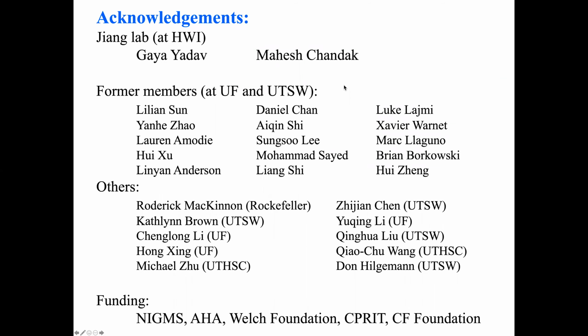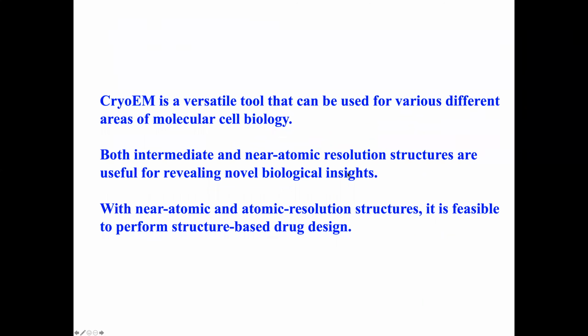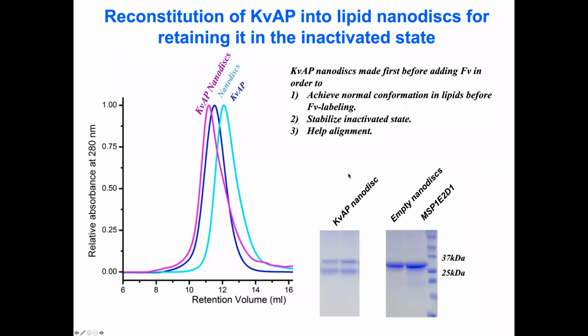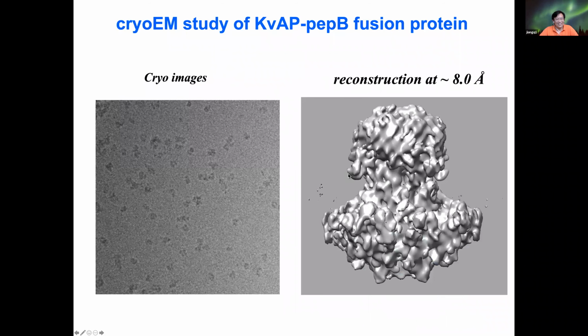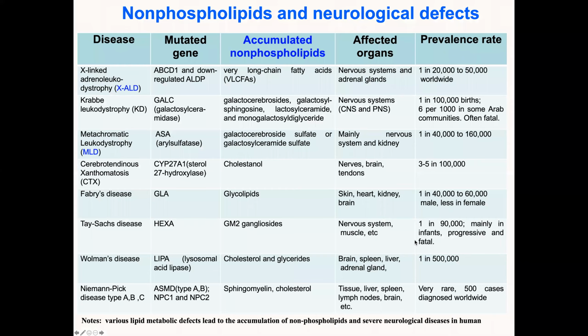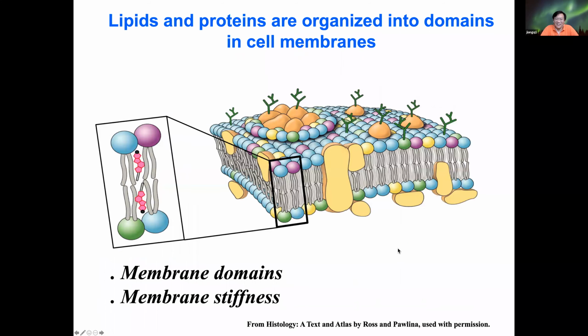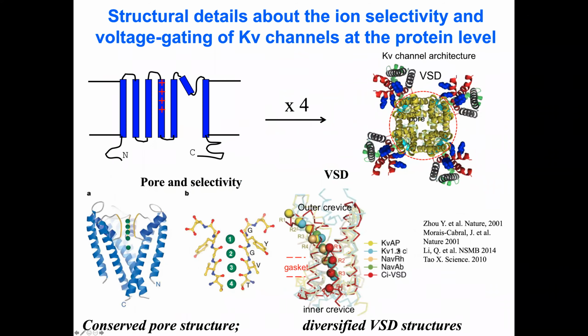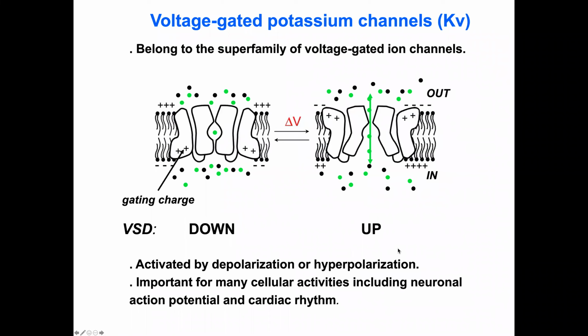I had a small question about your project 3, where you said that based on the observations, you concluded that it might be C3, the physiologically relevant form of this filament. And I remember you showing data that said that C3 usually forms when the conditions are high salt. Yes, high salt is around 150 to 200 millimolar, which is physiological. That is exactly what I wanted to know, how relevant it is when you compare it to the biological salt conditions.